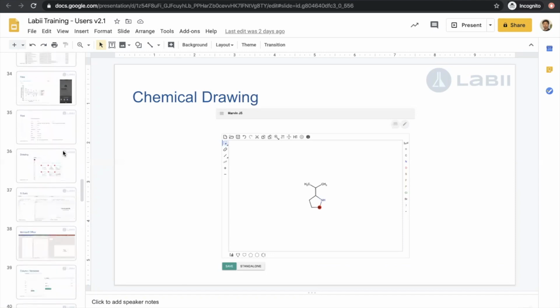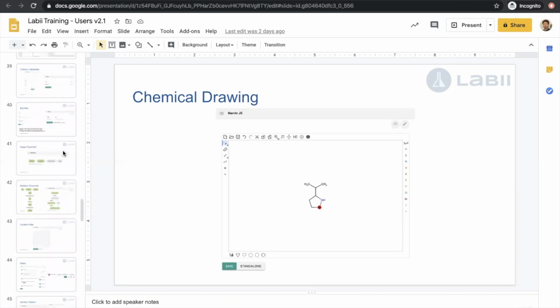Yes, so you may notice that for an experiment, the permission is controlled by your administrator, for example, by Jack. Jack will create many different projects, and then he will say this project can only have this many people working on it. If you want an experiment that no other people work on, you can ask Jack to create one project for you, and then you just put the experiment inside that particular project.